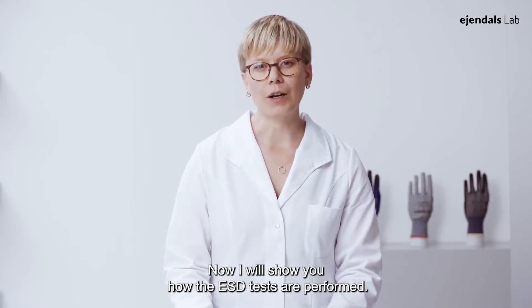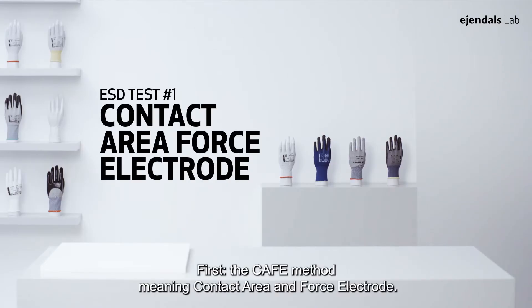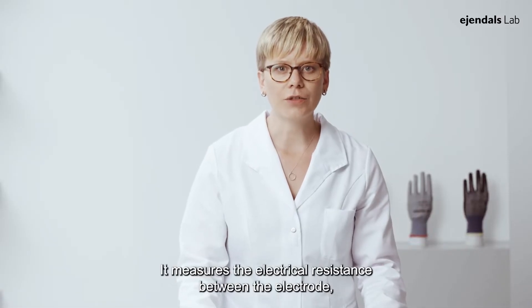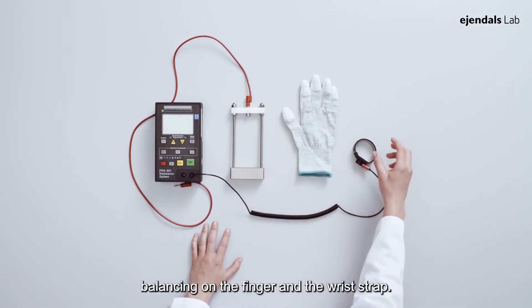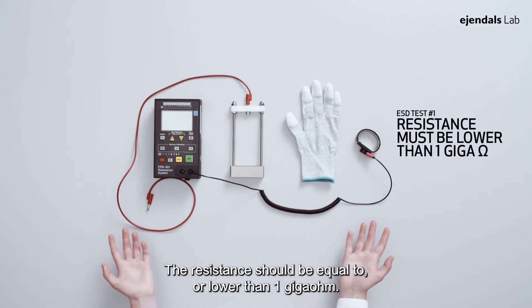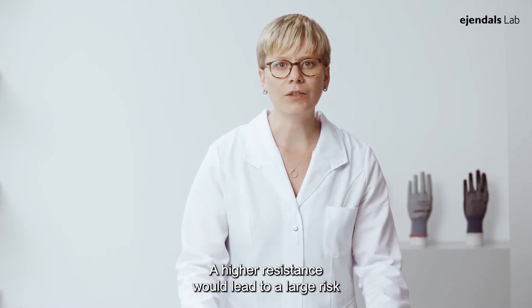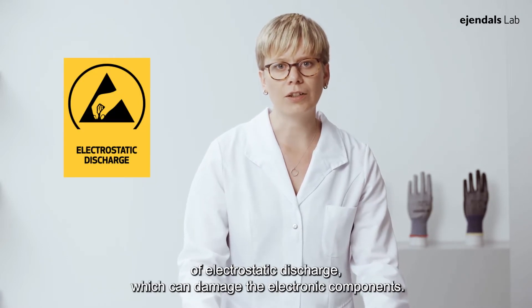Now I will show you how the ESD tests are performed. First, the CAFE method, meaning contact area and forced electrode. It measures the electrical resistance between the electrode balancing on the finger and the wrist strap. The resistance should be equal to or lower than 1 Giga Ohm. A higher resistance would lead to a large risk of electrostatic discharge, which can damage the electronic components.